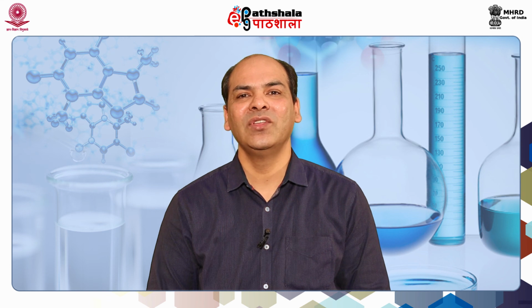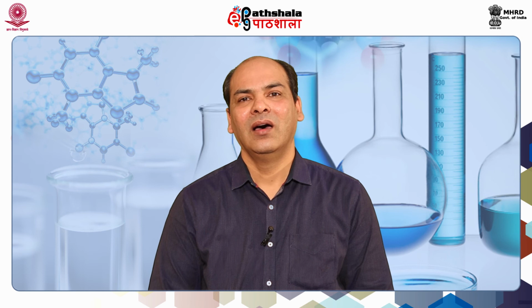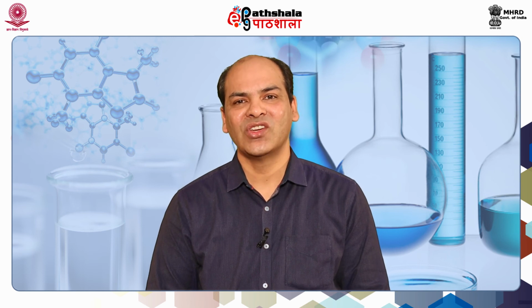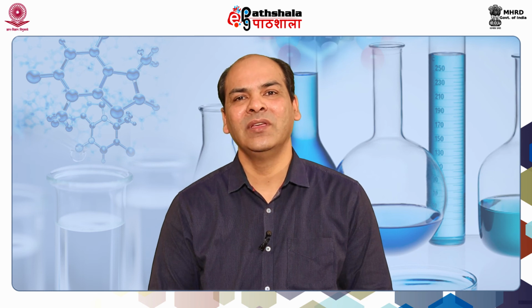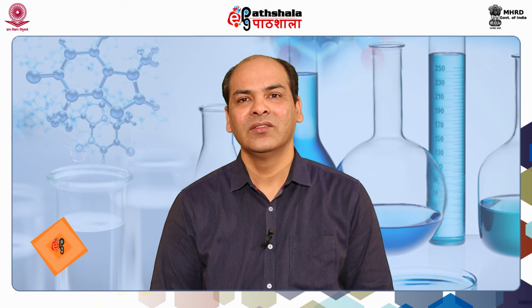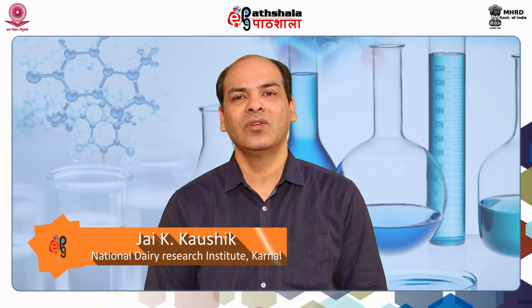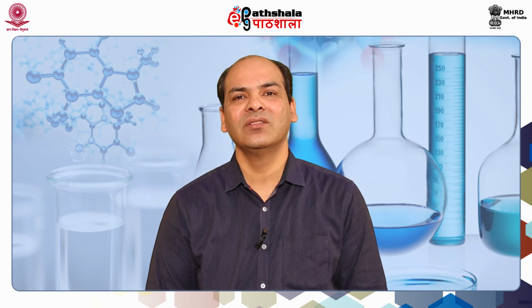A similar concept we can extend to molecular structures. Molecular structures which are asymmetrical we call, in chemistry terms, chiral, or having chirality. In the next slide we will see which molecules are asymmetric, which we call chiral.